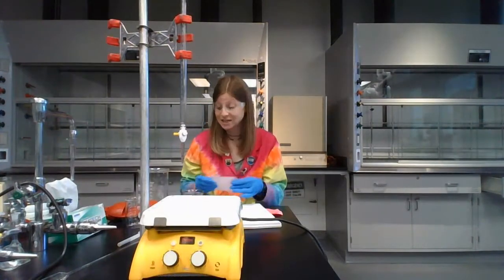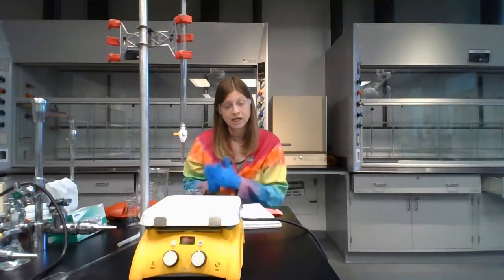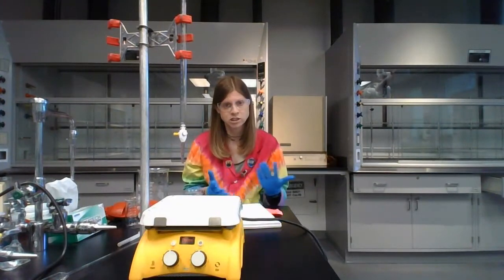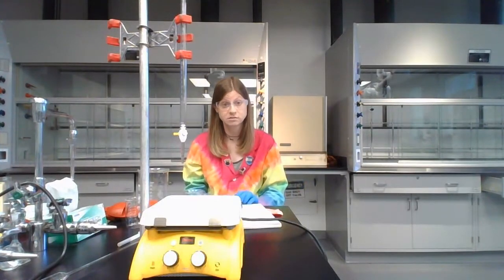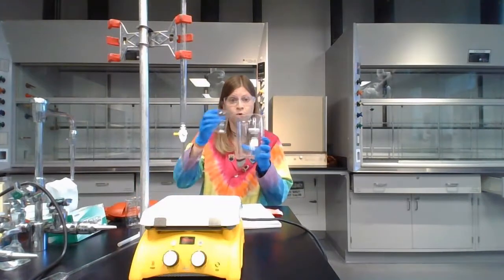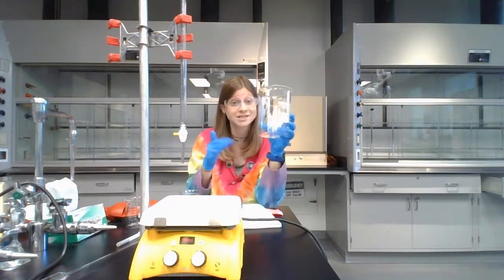So you're going to do 6 of basically the same titration. It's just in part B, you're using sodium oxalate. In part C, you're using unknown. But the way that you do this is going to be the same for both of them. So you'll do your 6 titrations. The results of your 6 titrations all need to be poured into the giant waste beaker for the mixtures, the solutions that touched each other.